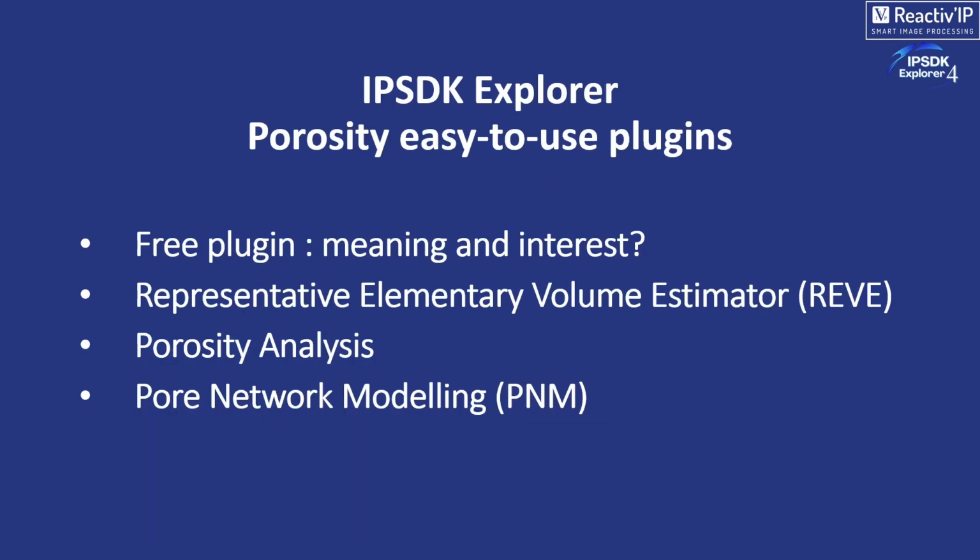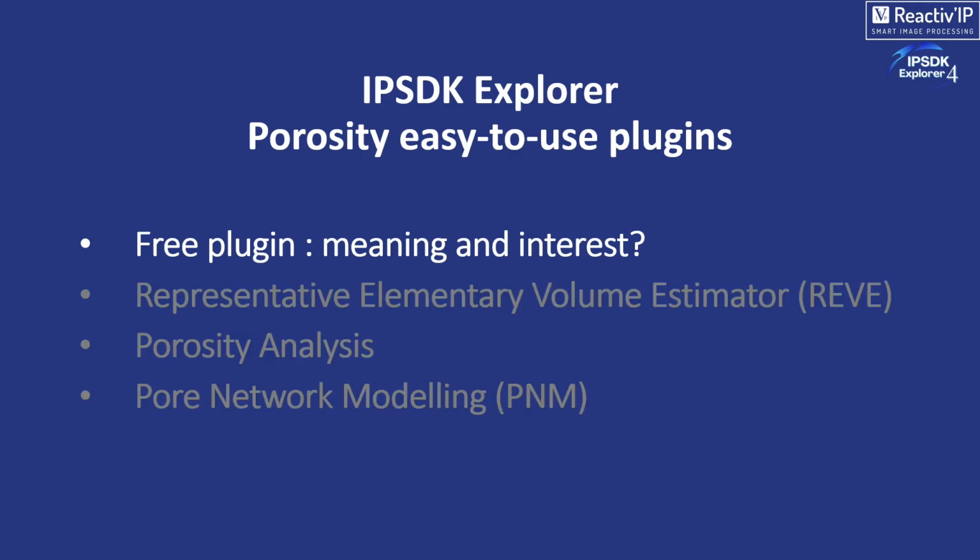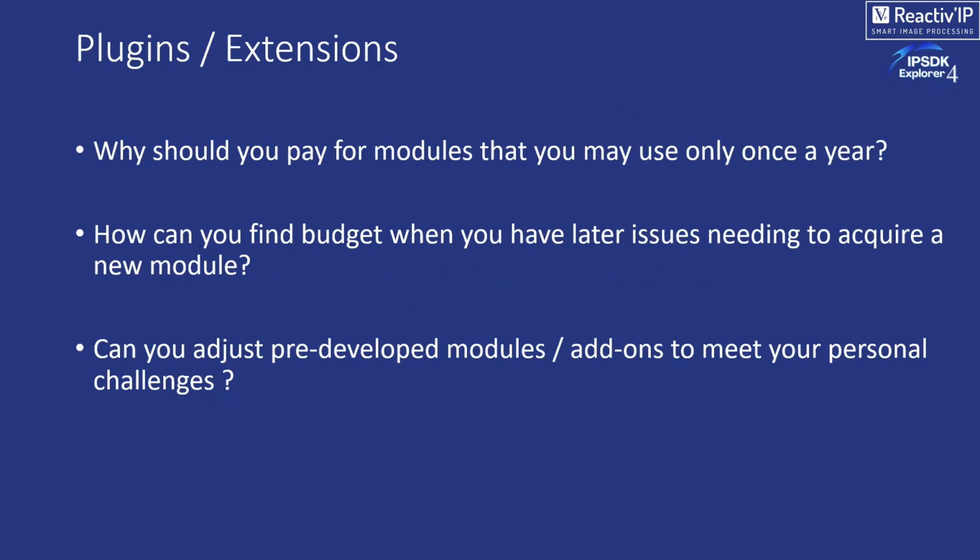But before we jump into the pure porosity, what's the interest of getting a plugin? What's the meaning of a plugin? In most of the software of our competitors, you will get modules. So they propose a basic package and they propose modules. But then you have to purchase all the modules, even though you may be using one only once or twice a year. But that's the main question: is there any return on investment? Is it interesting to pay for something that you will barely use?